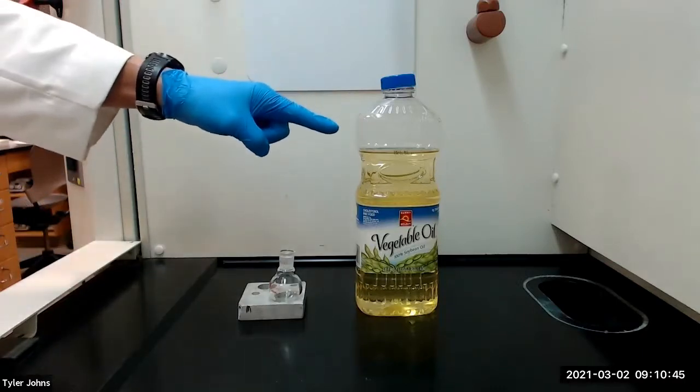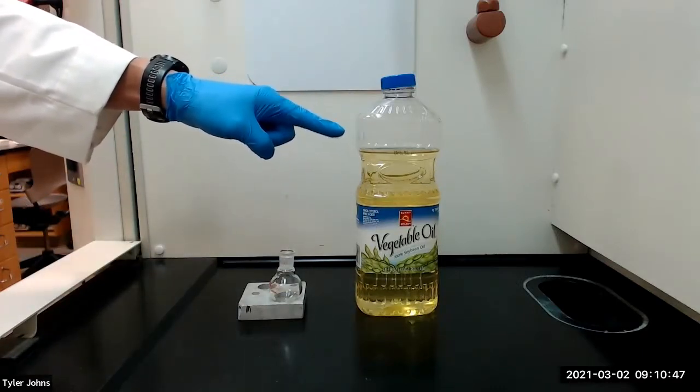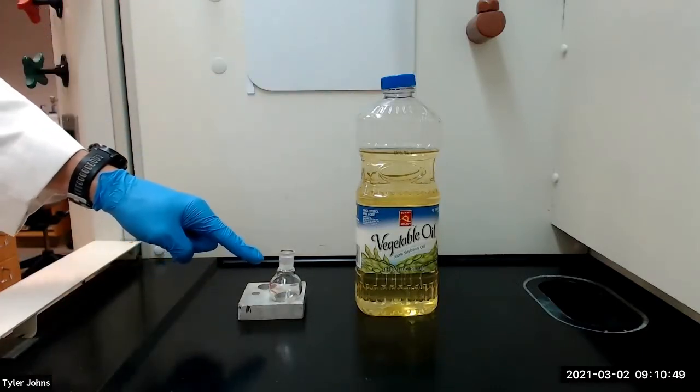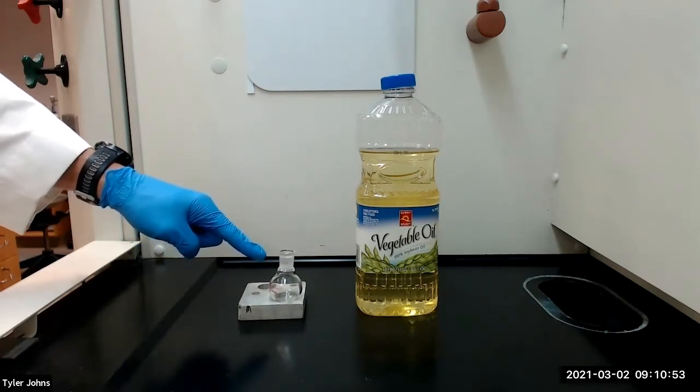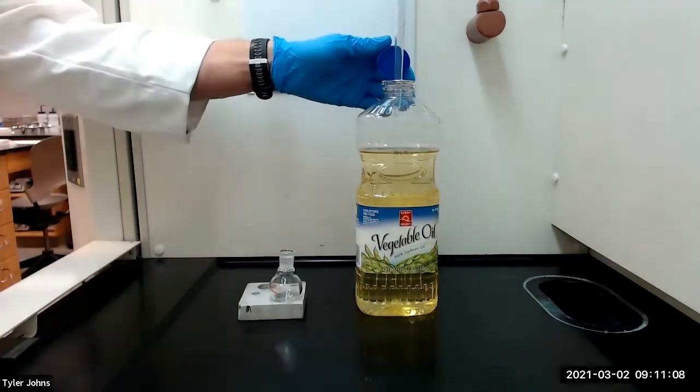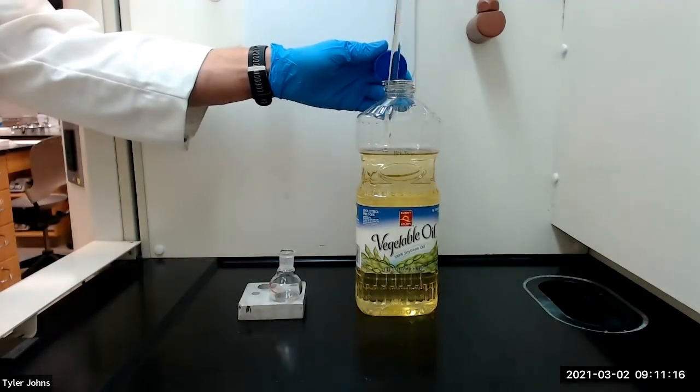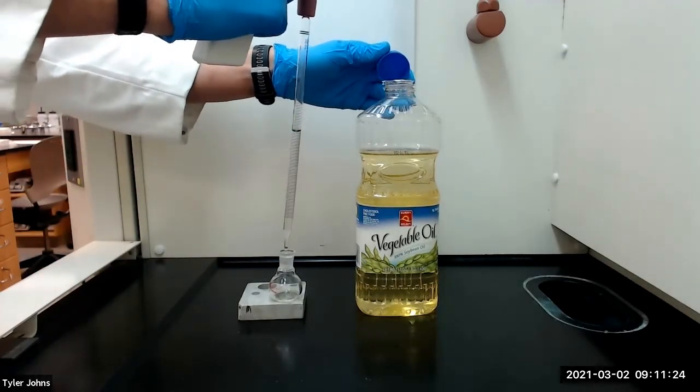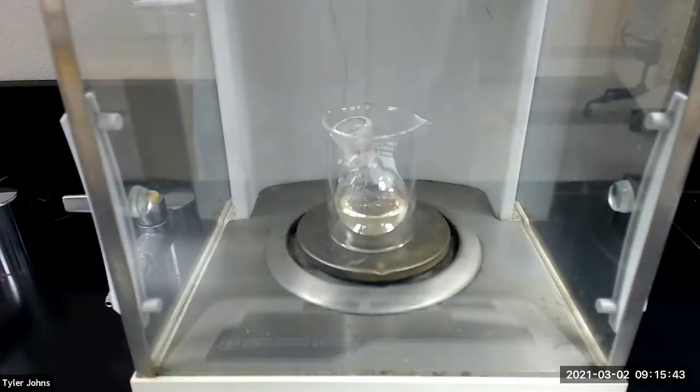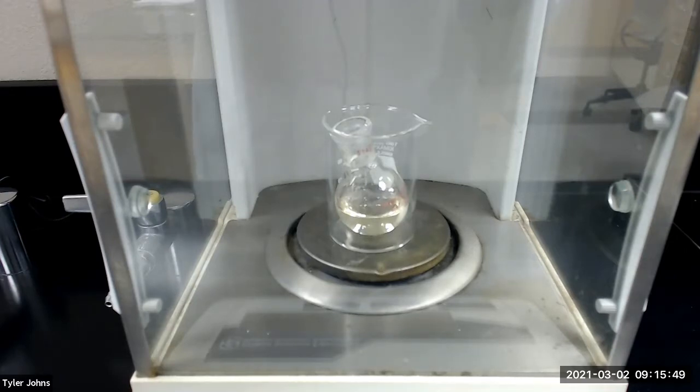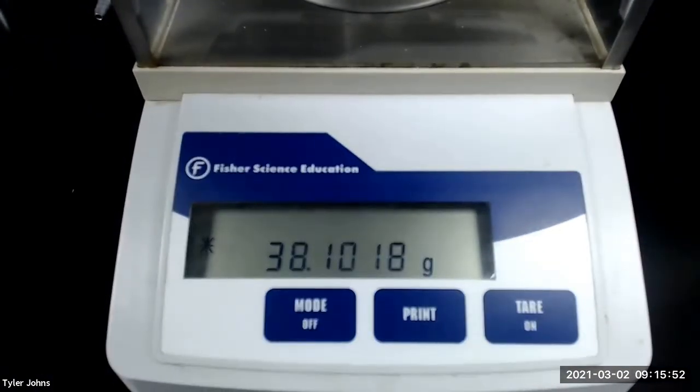We next need to add 10 milliliters of vegetable oil to the pre-weighed 25 milliliter round bottom flask and then re-weigh the flask plus the oil to get the weight of the oil. The mass of the pre-weighed 25 milliliter round bottom flask plus the vegetable oil is 38.1018 grams.